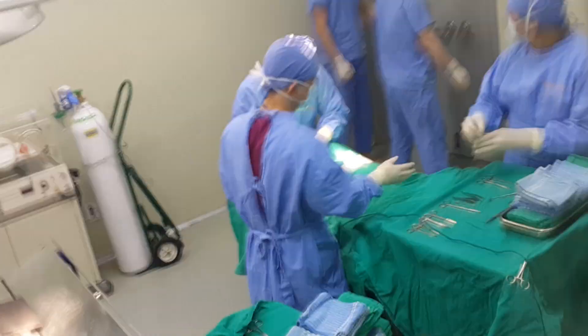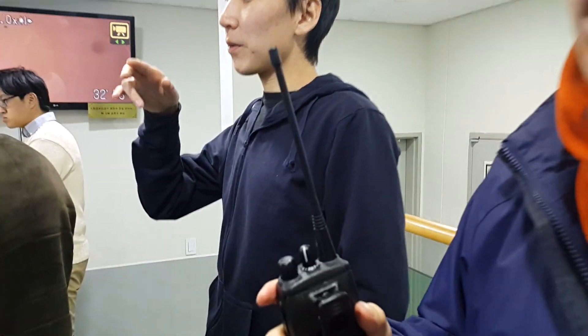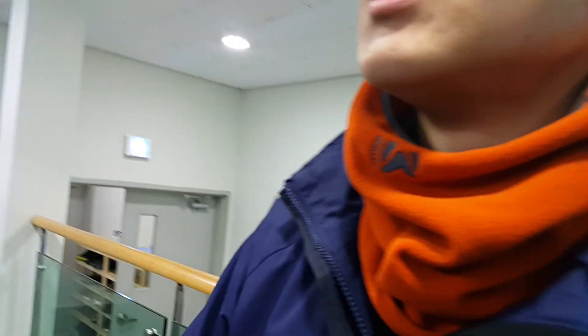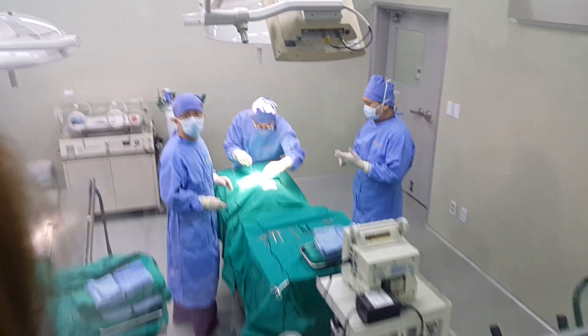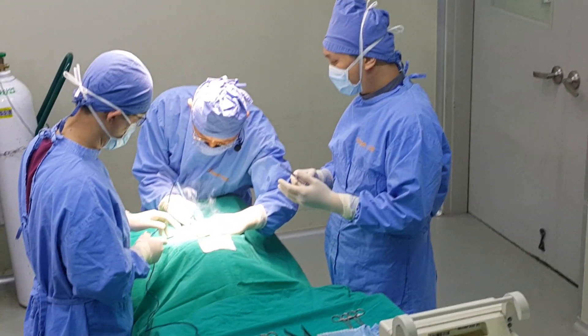The process we're going to do is called the embryo transfer process. It's a process where we transfer the clone embryo into the surrogate mother. Before this project, this surgery itself used to take more than two hours. The pregnancy efficiency was less than one percent. But now the procedure itself takes less than five minutes.